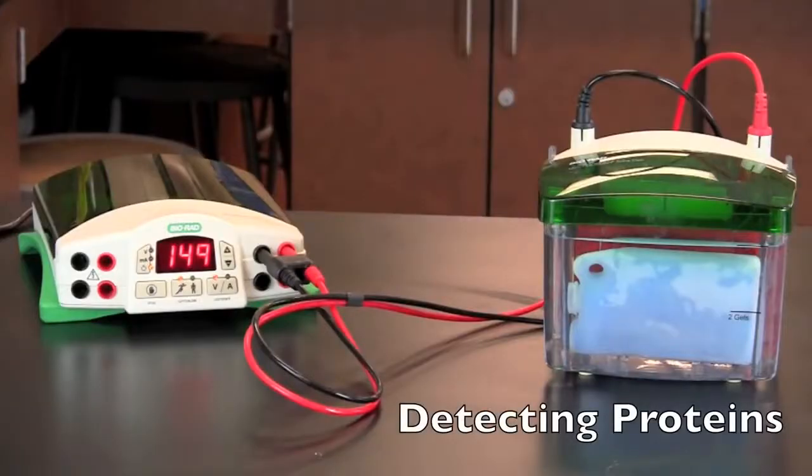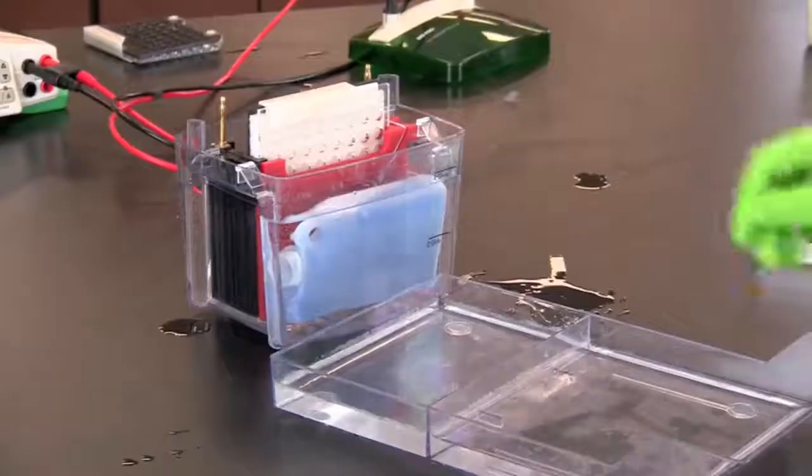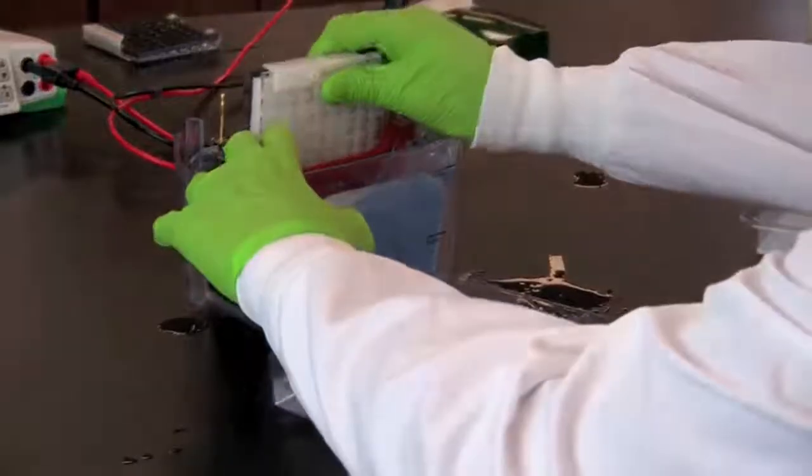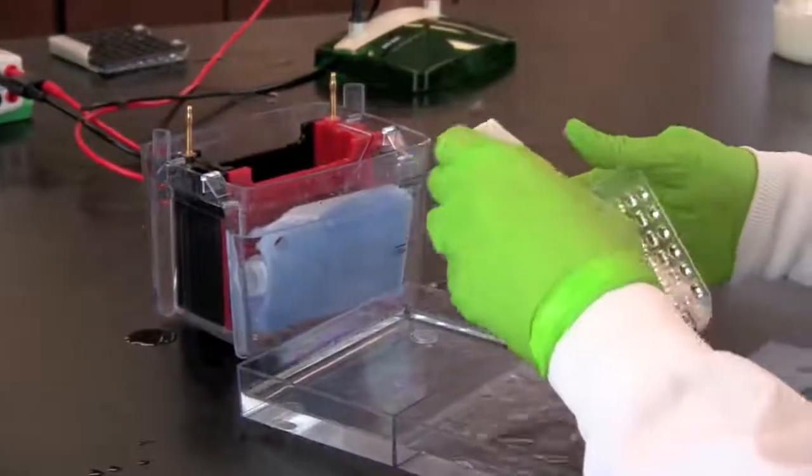When the run is complete, turn off the power supply and disassemble the electrophoresis chamber and remove the inner module. Open the module and place it in a container filled with blotting buffer with the black side down.